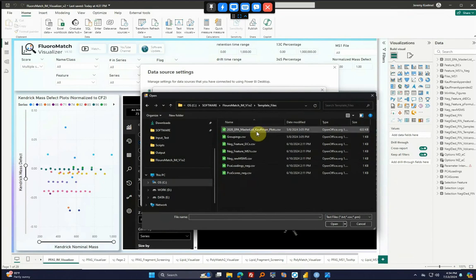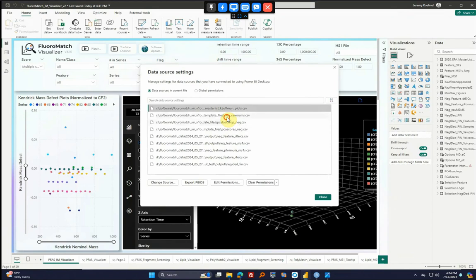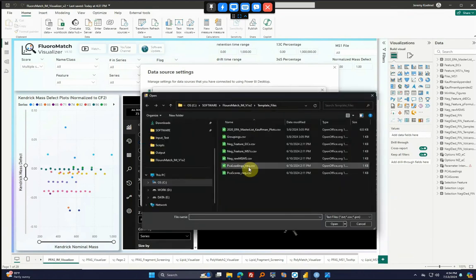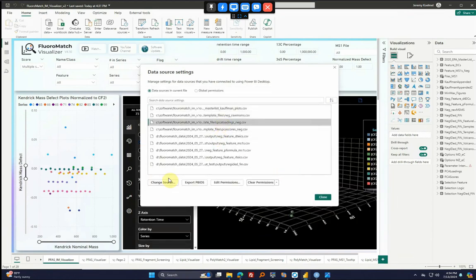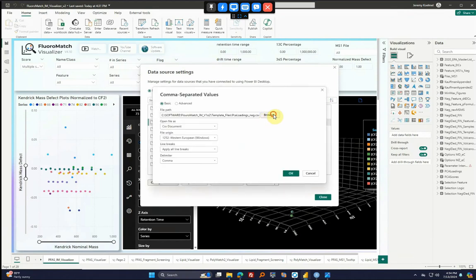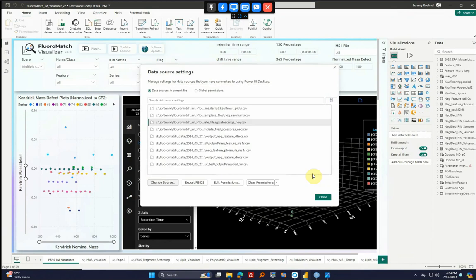The Kaufman is like the background ions for the Kaufman plots. This is in case you have MSMS data in the future using like the PNNL preprocessor. But since most people will not have MSMS data, you just use this template file as an empty file just so that it doesn't error. Also, statistics for the future, you'll potentially want them, but in this case, just get them from the templates file. You won't actually use these.